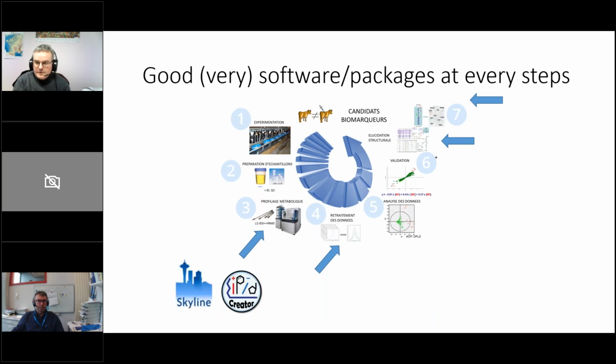Other tools are really interesting, but I won't go through them today. It's Skyline that now has some metabolite features, metabolite annotation features, and lipidomics-related modules, add-ons. For those of you who are doing lipidomics, please have a look at these. Maybe it can save you a lot of time.